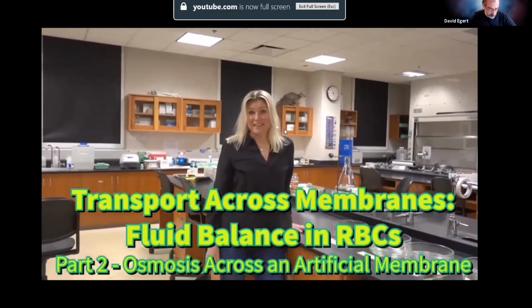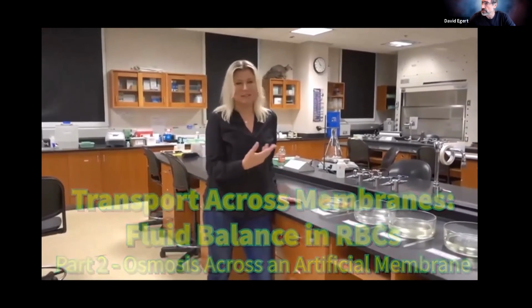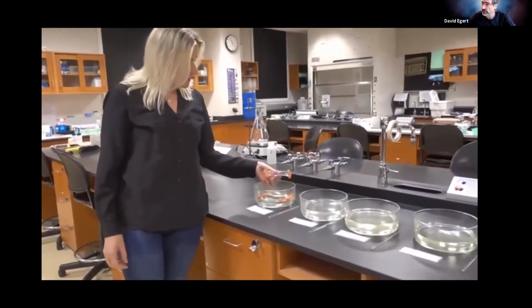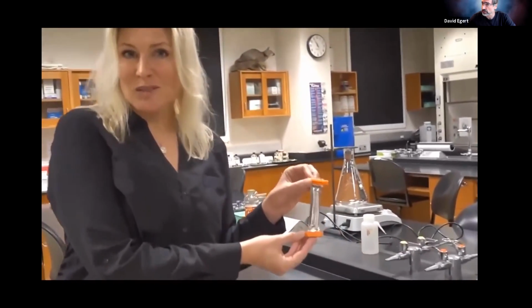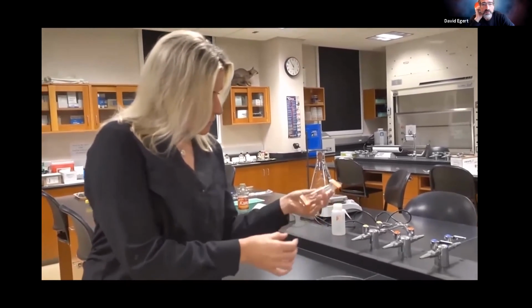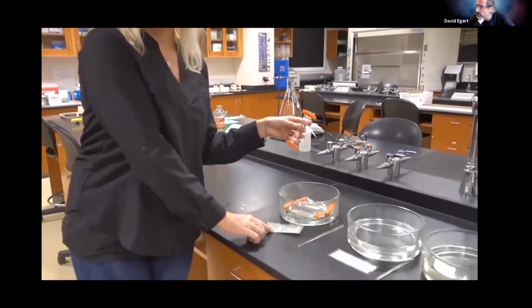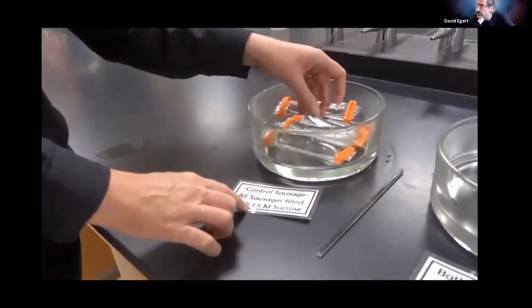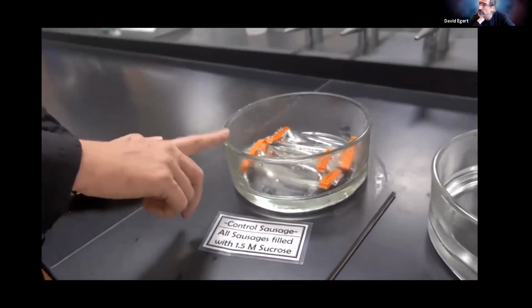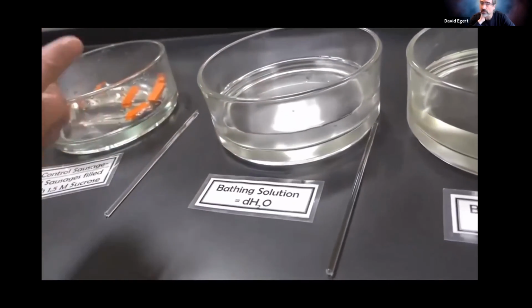Okay. All right, so we're learning about osmosis and tonicity in this course, and so here we're going to do a demonstration of osmosis. So what I have here are 4 kind of sausages made by dialysis tubing. So we fill them with 1.5 molar sucrose solution, and so all 4 have the same, and they're about the same size. Next, we're going to stick them into different solutions, and we're going to see which way the water is going to move.